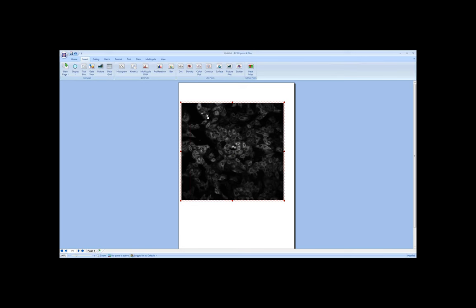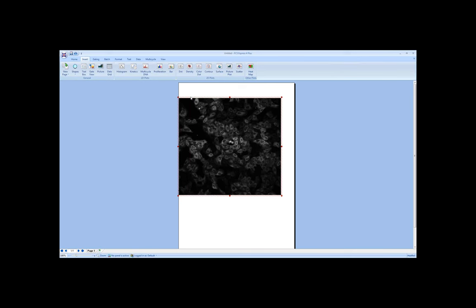segmentation software you have, what we can do is bring in an actual interactive image where we can say, let's select this portion of cells and let's look at them represented in a histogram or a dot plot. Or even with a histogram or a dot plot, we can select a region of cells in that plot and then look where those cells came from back in the image. So let's move this raw image over to the side, just so you have an idea of what this looks like.